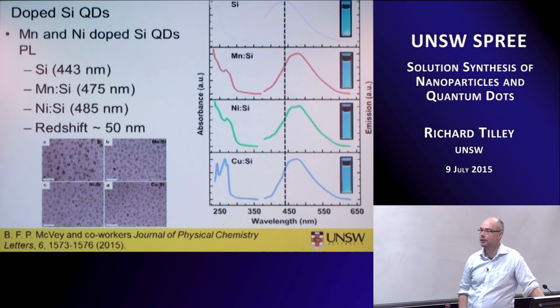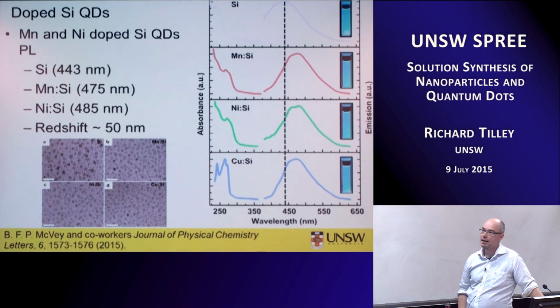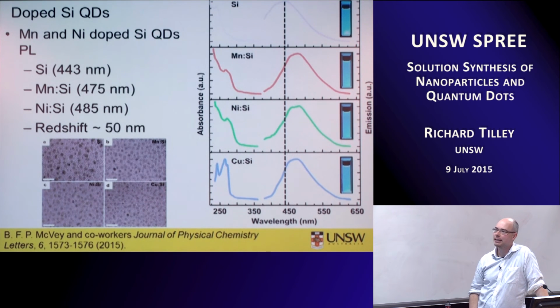Very chemically incorporated. Yes. The previous slide you showed the... Yes, that's right. But I guess some of the TEM techniques are capable at least of picking up the position of the atom. Possibly. I think with some of the EELS techniques, you could, if you got lucky, hunt it down and find it. The other one would be atom probe tomography. Absolutely. So I think that would probably be a better bet actually, really trying to see some kind of three-dimensional slicing through the dots.